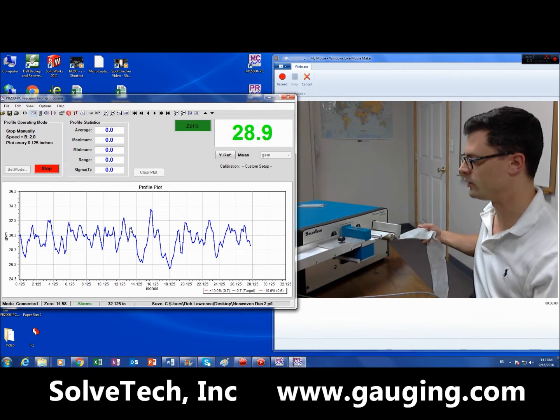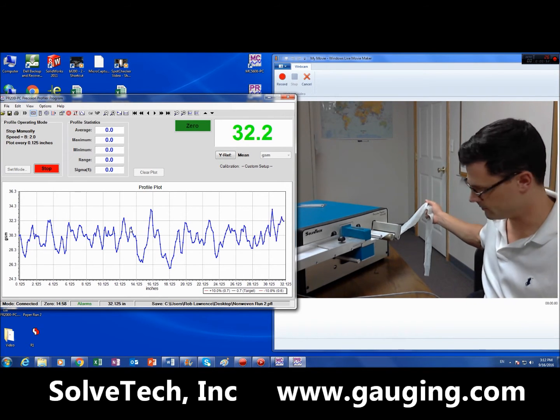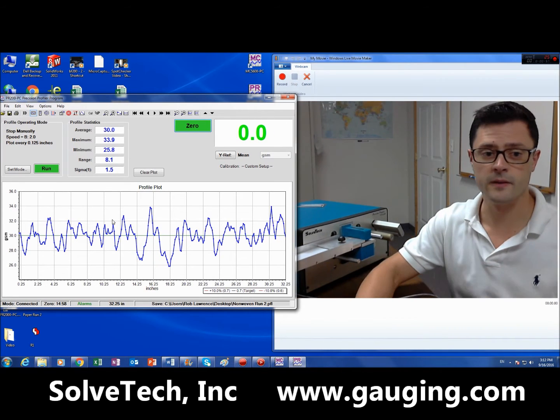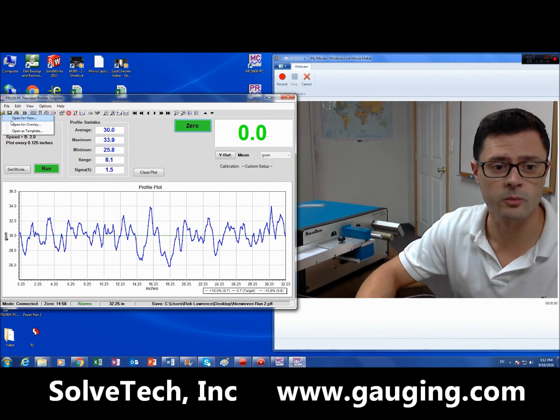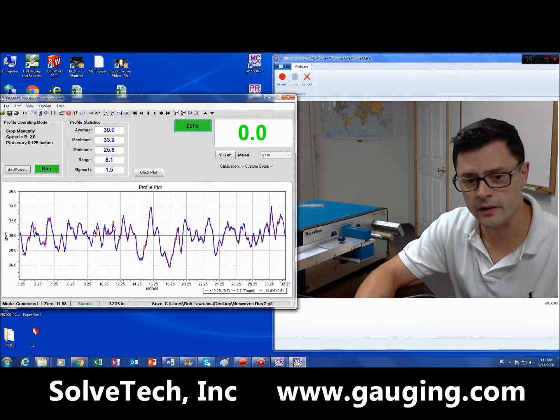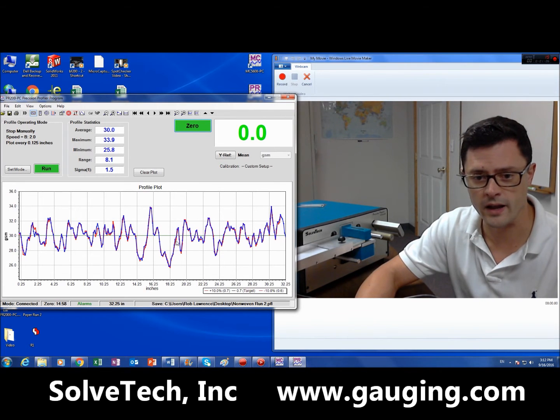Really simple and easy to use, and extremely easy to calibrate. So I've done that run, now I'm going to overlay the previous run — we can look at two — and you can see how tightly this matched.